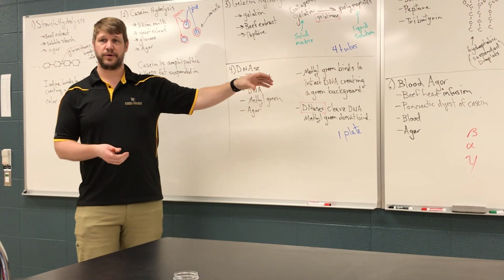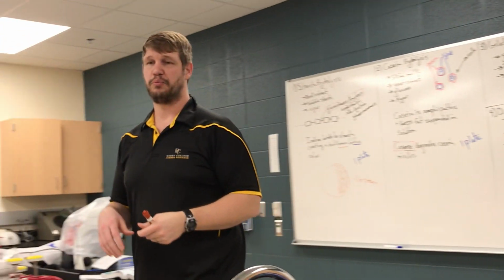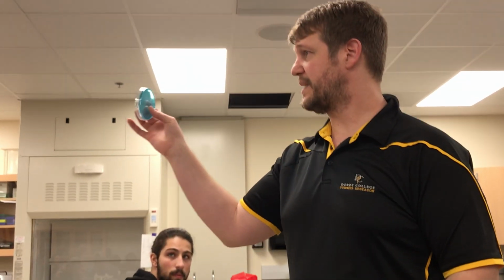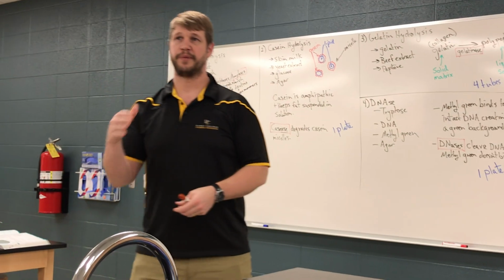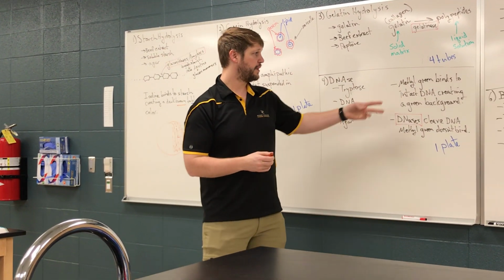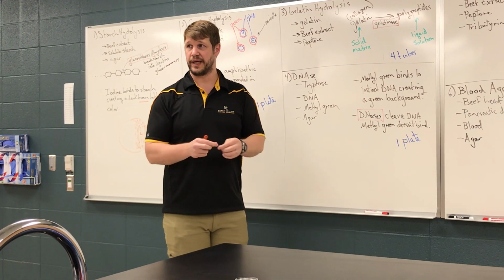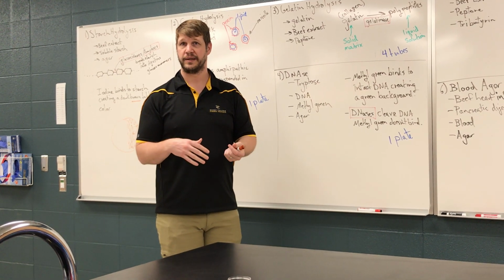And so the methyl green, when the DNA is intact, will create a green background. It's really quite pretty. Right? So this is our DNase agar. Basically what we're looking for, if the organism is capable of degrading DNA, the methyl green will not be able to associate with it anymore, and you'll get a clear halo around the organism that's capable of degrading DNA.